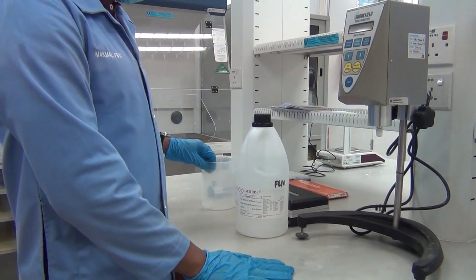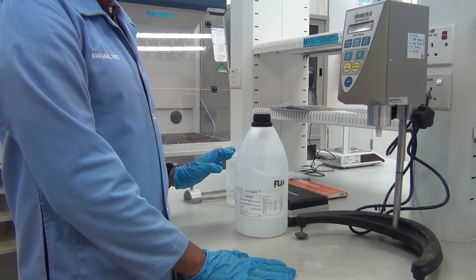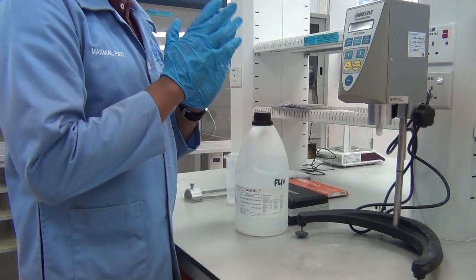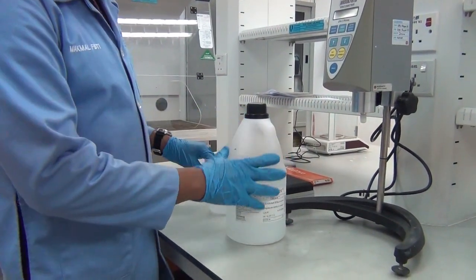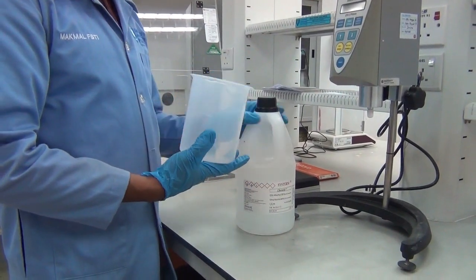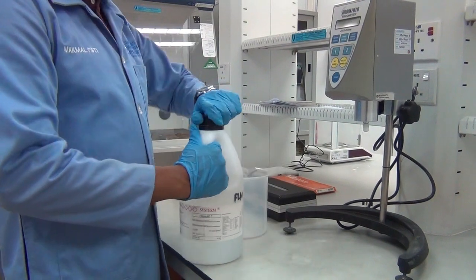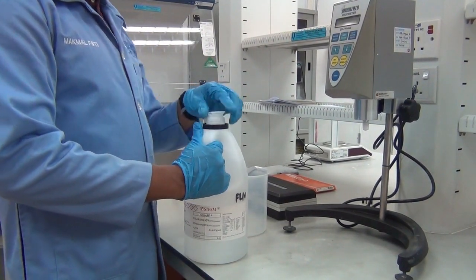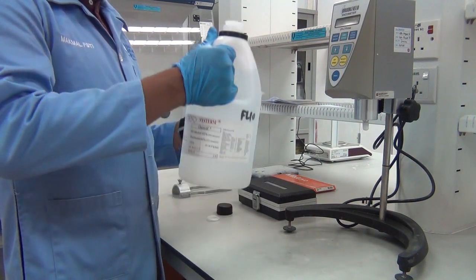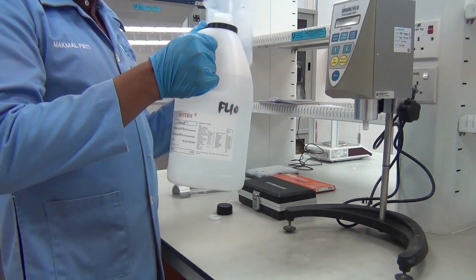First thing first, we need to prepare all the samples and materials and make sure the instrument is working. This is ethanol and this is our cup to measure, where we fill the ethanol inside. To use this instrument, we need at least 500 ml to put this ethanol into this cup.